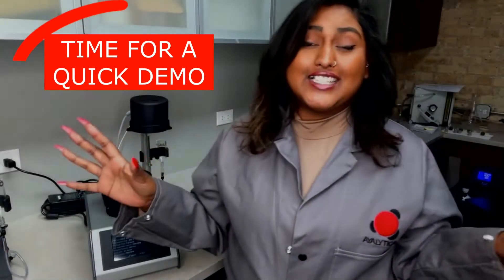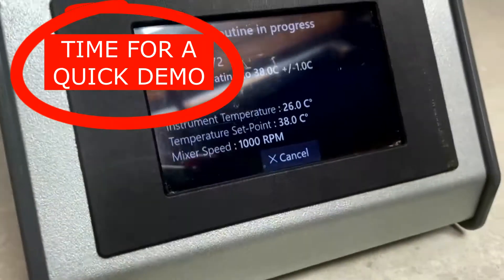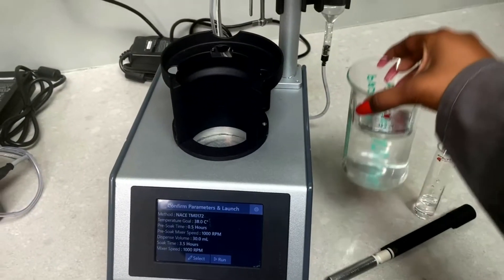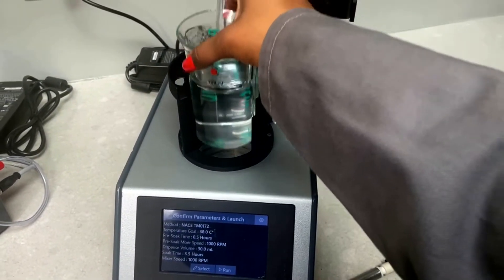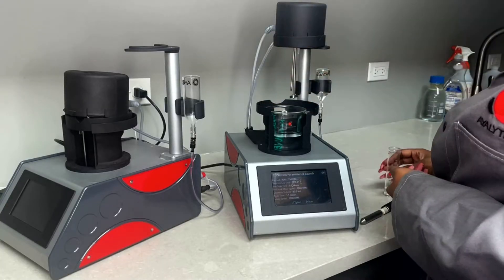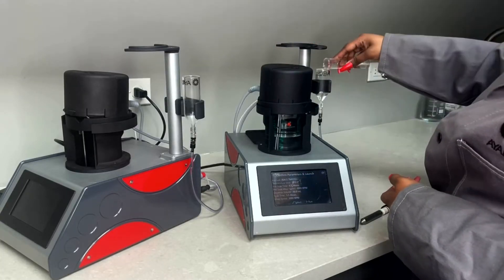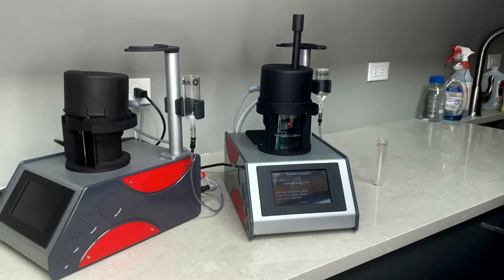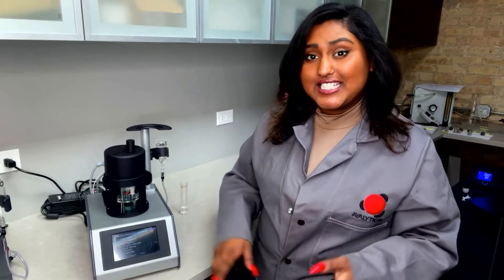Okay, let's run through a quick demo together. First, we're going to load the sample into our beaker, place the beaker into the bath, load the pre-polished specimen into the pump, add water into the dispenser, place the mixer-puck assembly, and press start on the easy touch screen.